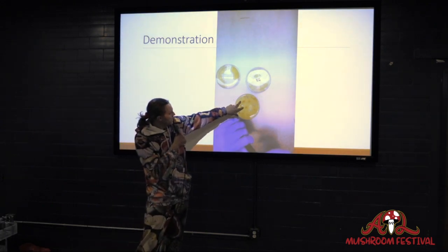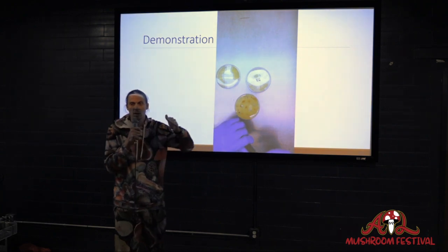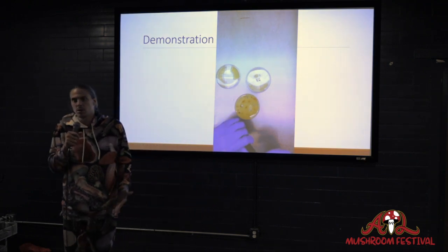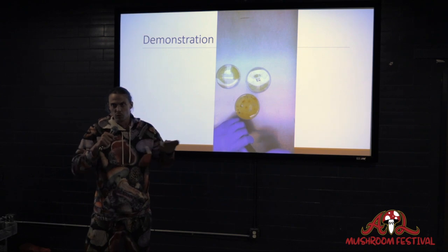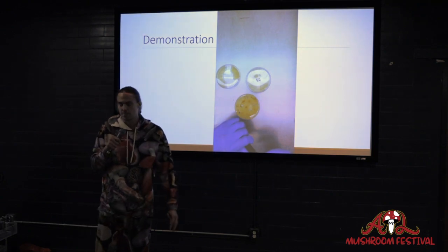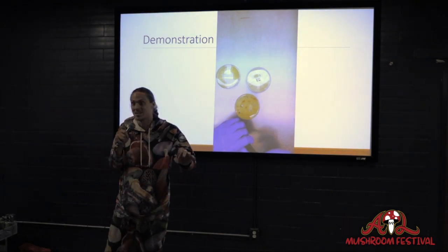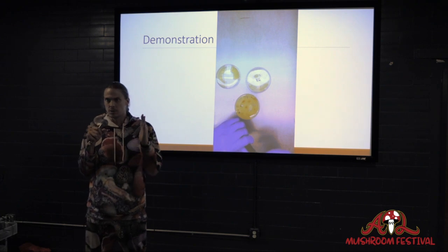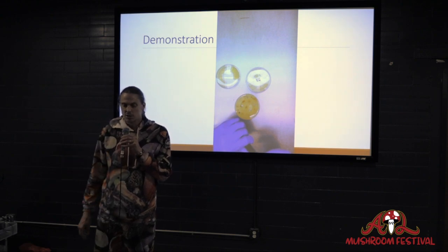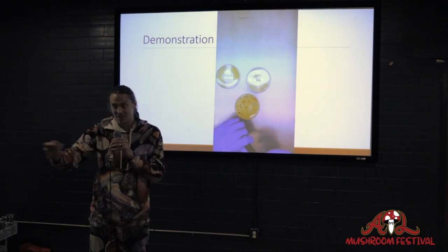You can see where the samples that I placed onto the plate were, and then you can see that I collected in between them. So I did not collect too close to the original sample, just in case there was a contaminant there. I collected just a little bit away from it to give myself a little bit of removal from that space. But if I am dealing with a very heavily contaminated plate, like it's nothing but soup and green, but there's a couple patches of white that I'm trying to isolate, then I will go ahead and sterilize in between each touching of the plate, because the second you touch it, it's contaminated, right? Maybe you can get one clean piece, but the second you reach for another piece, the tool's already dirty, and you're contaminating the next sample you're touching.